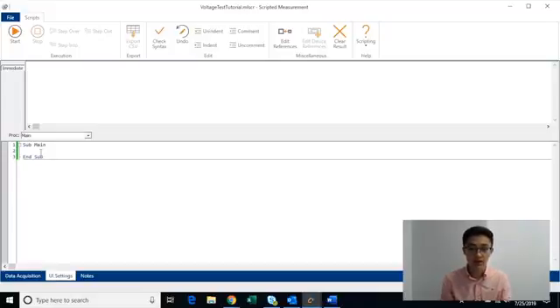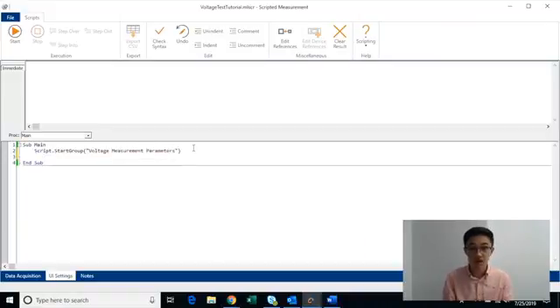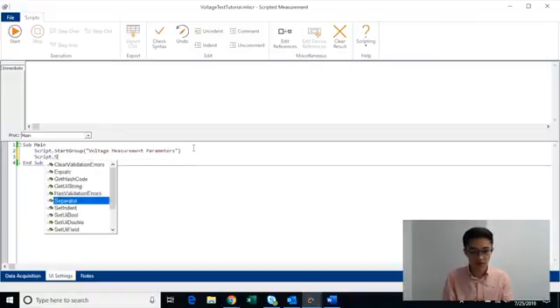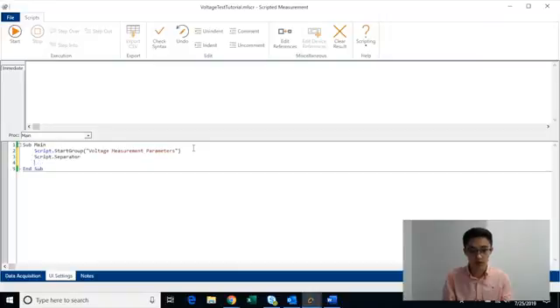But we can go ahead and do that by calling the start group command. The next thing we're going to call is script.separator, and this is just going to create a line break to format the UI. And then the next thing we're going to do is call script.numericTextBox, which will actually create the place where a user can enter in a parameter.